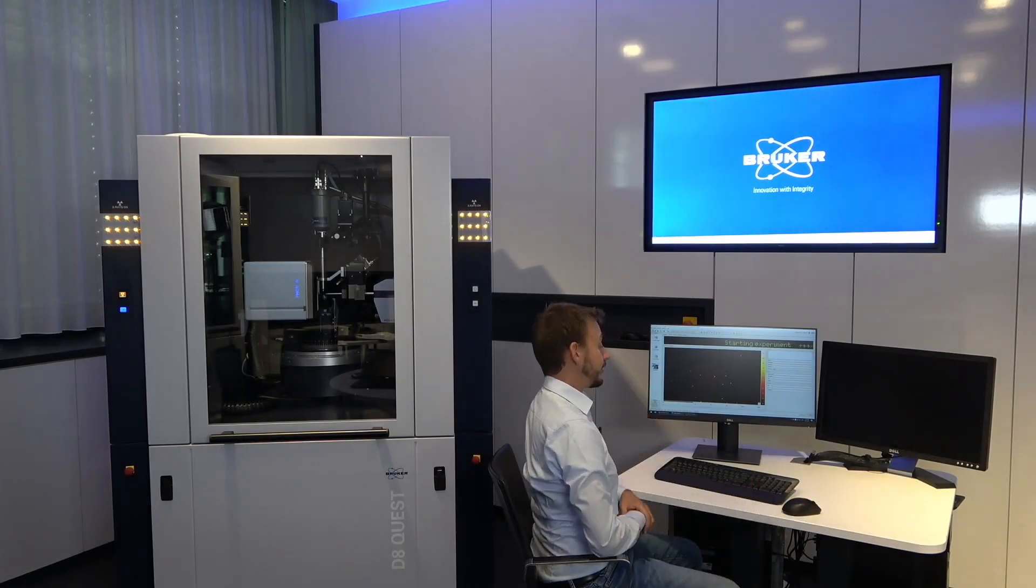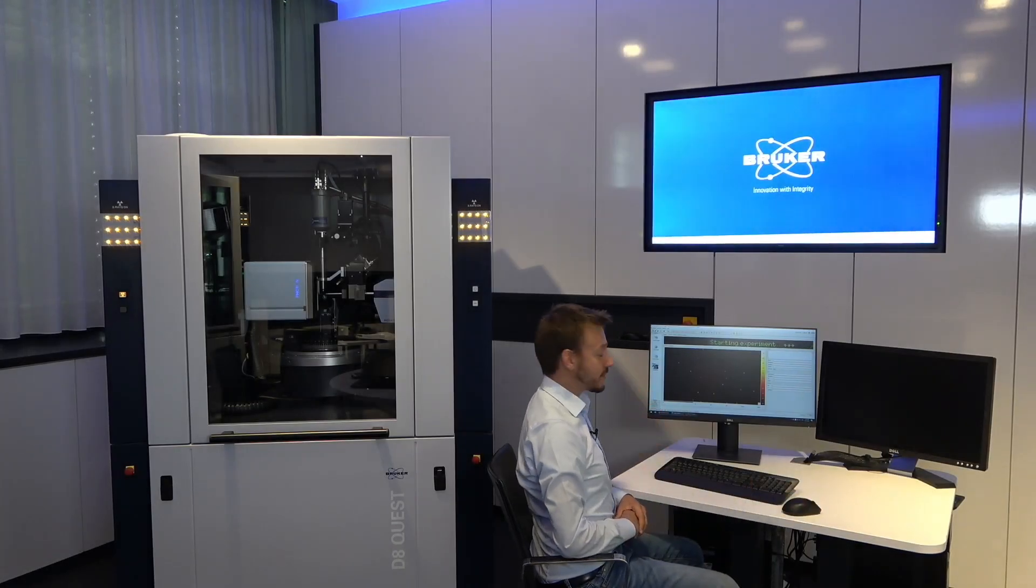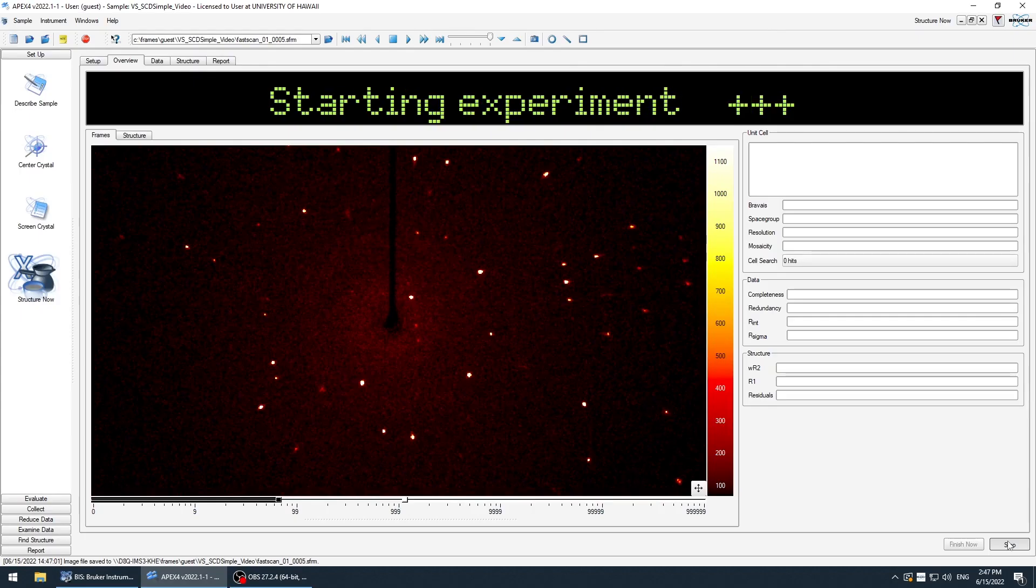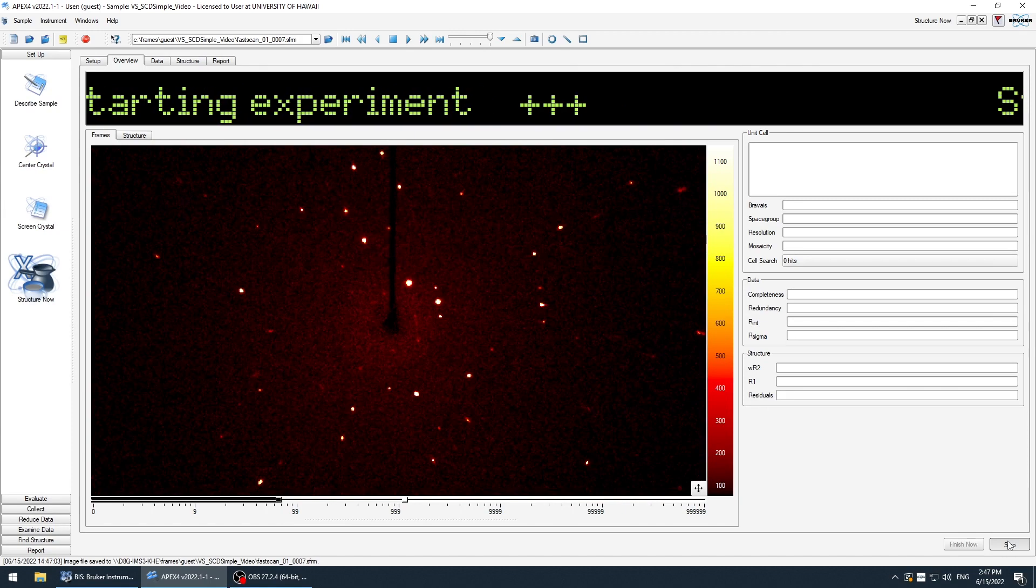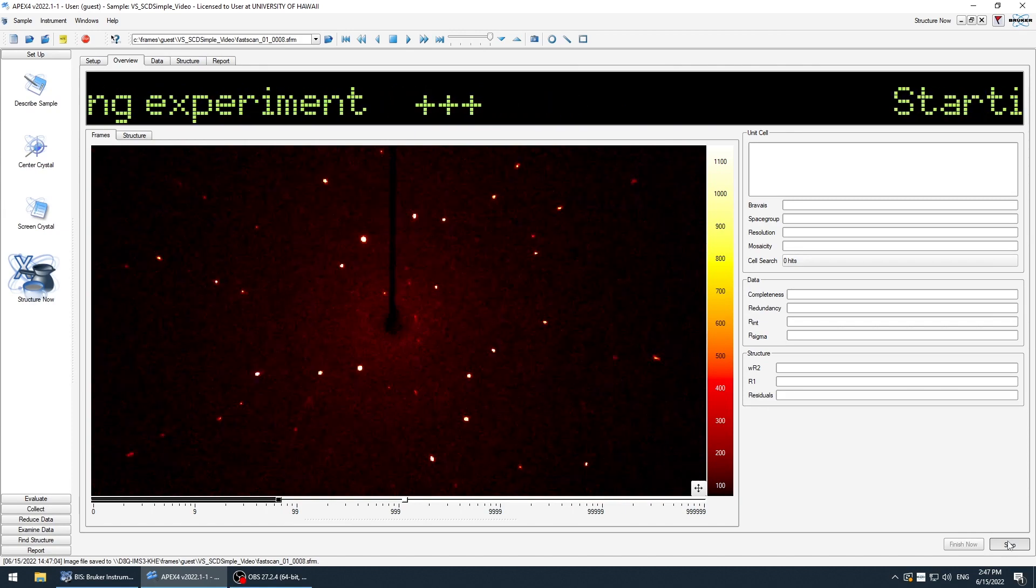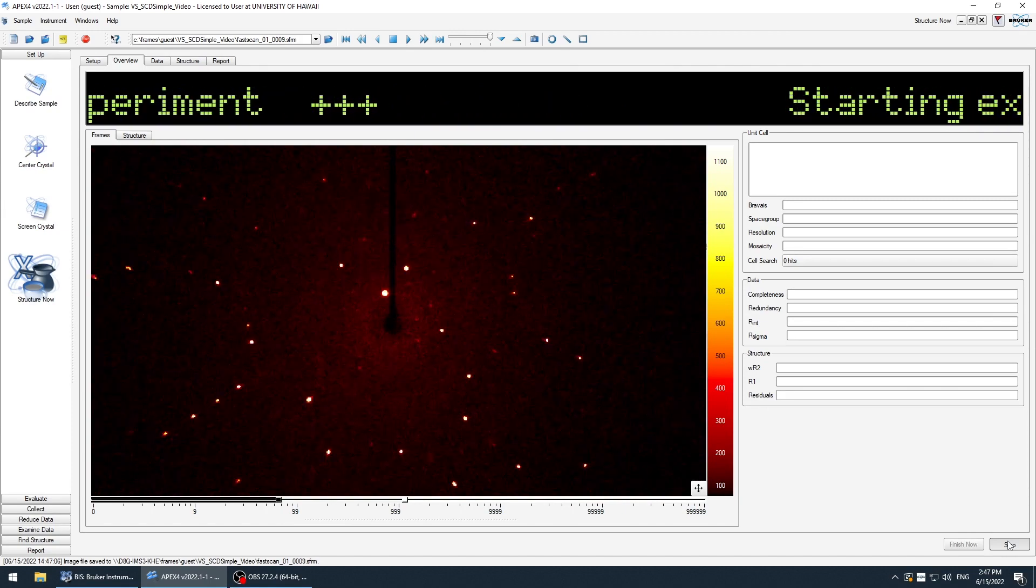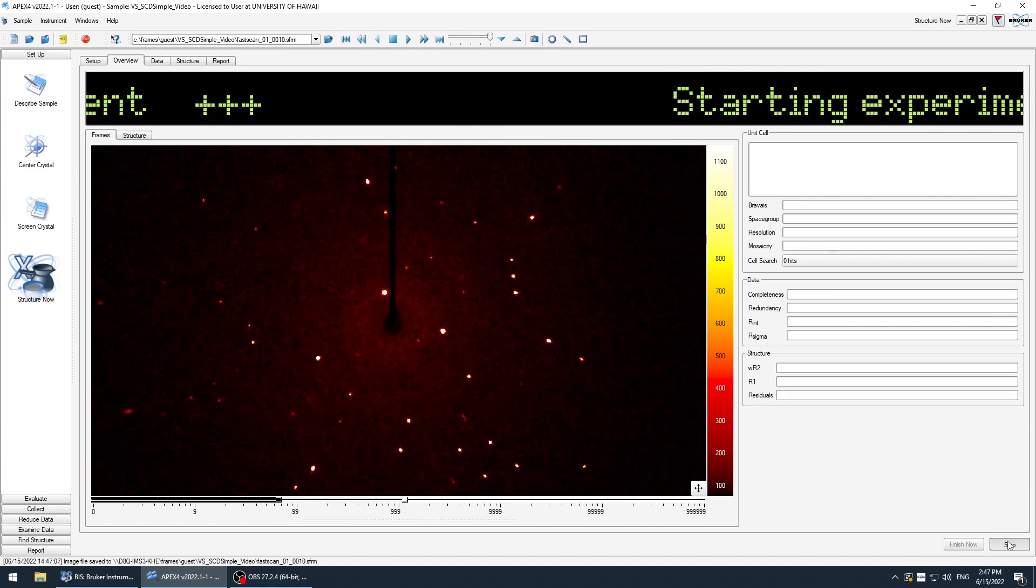So here are already the first frames. You see it's a quite nice crystal, very nice reflections, and you get a very good signal on our detector.